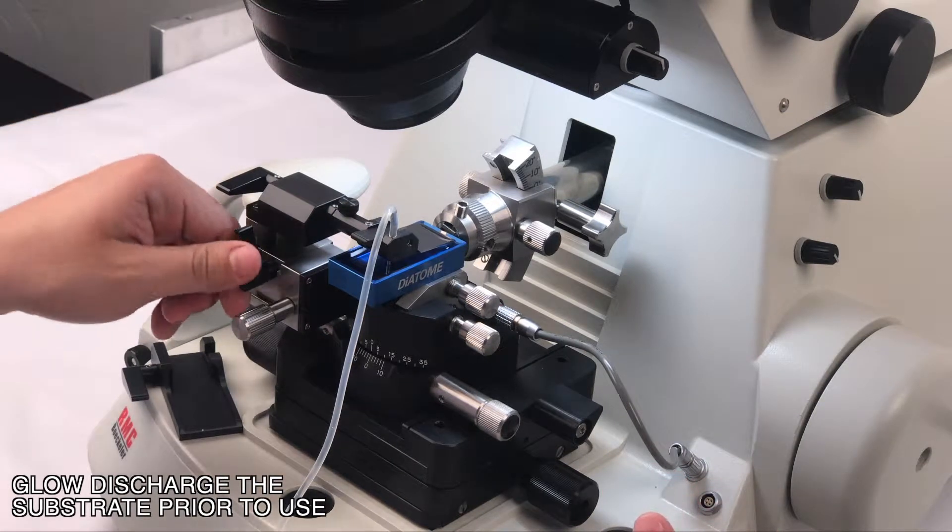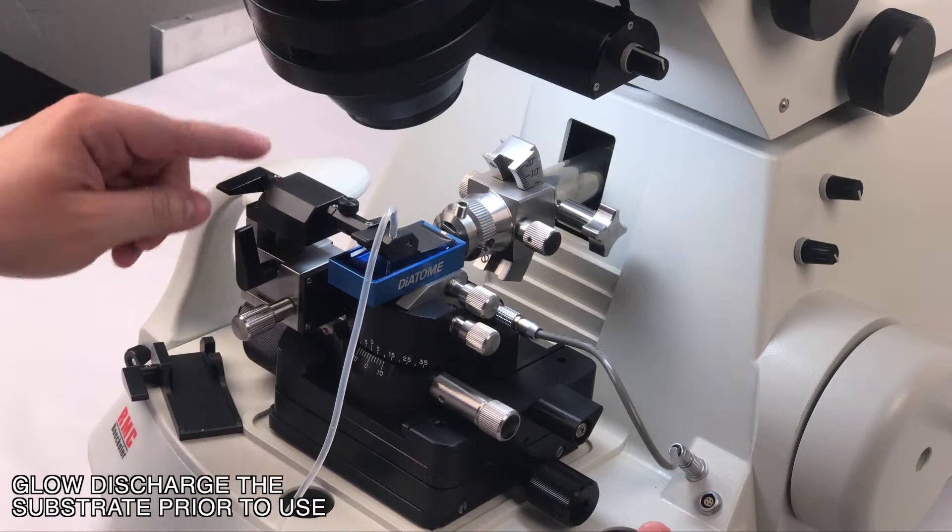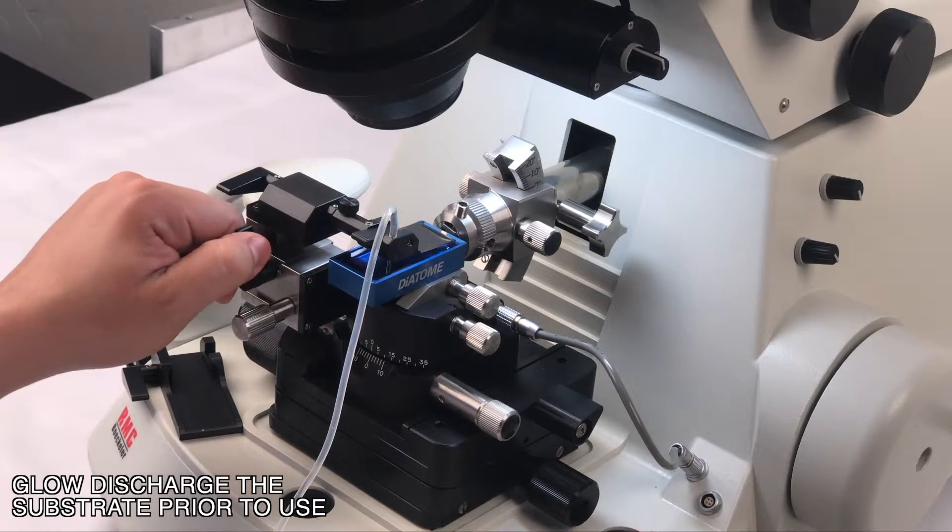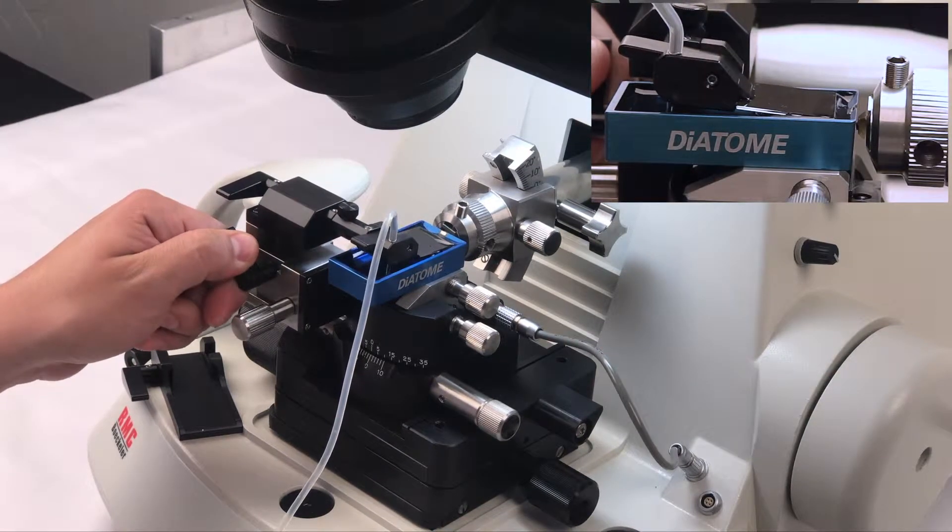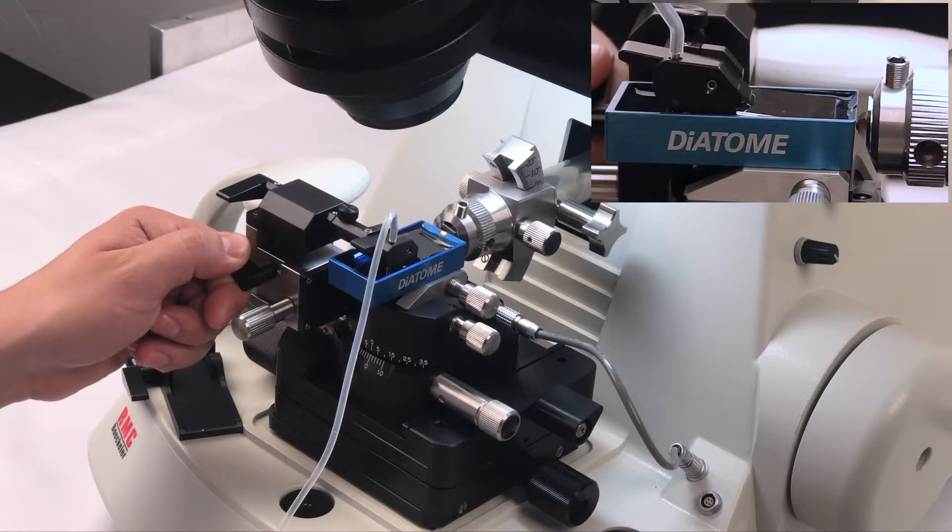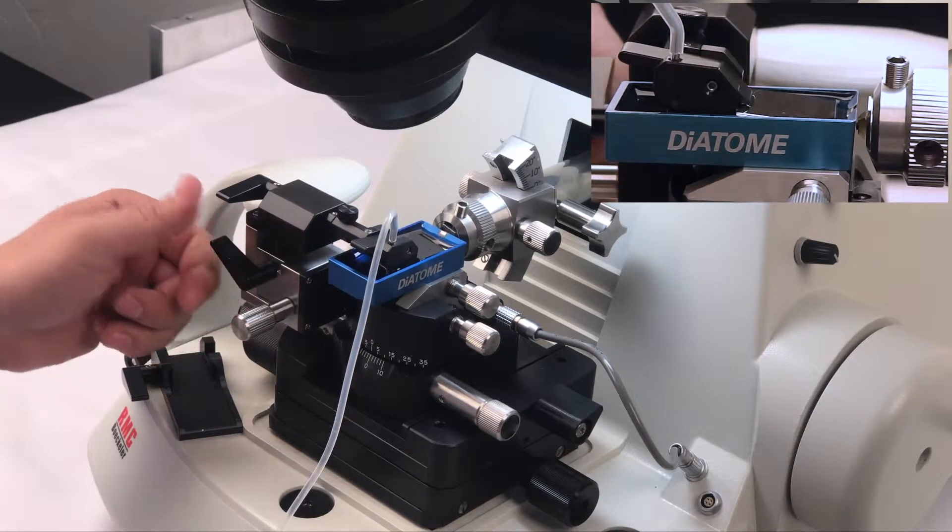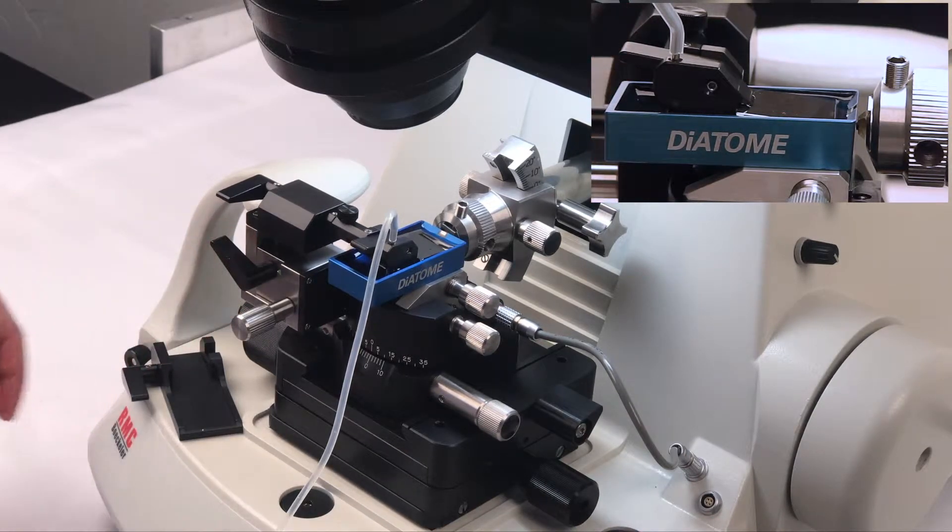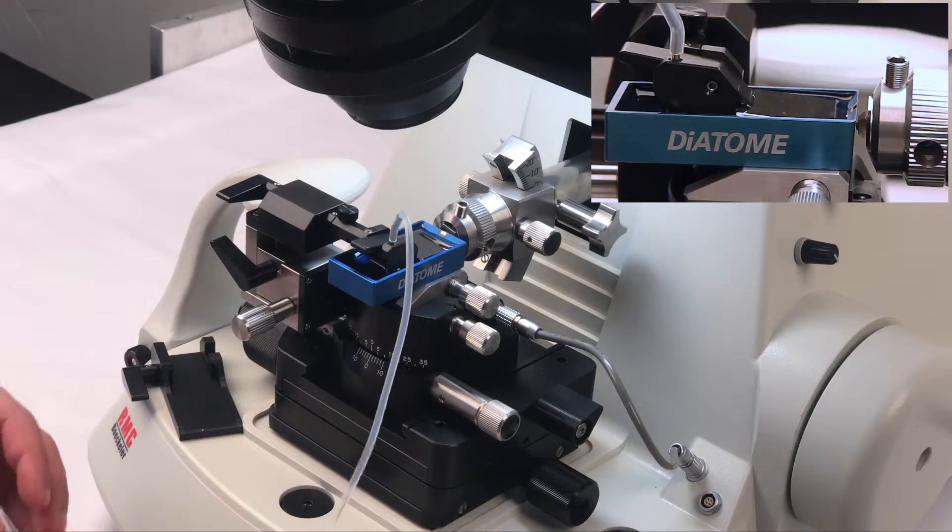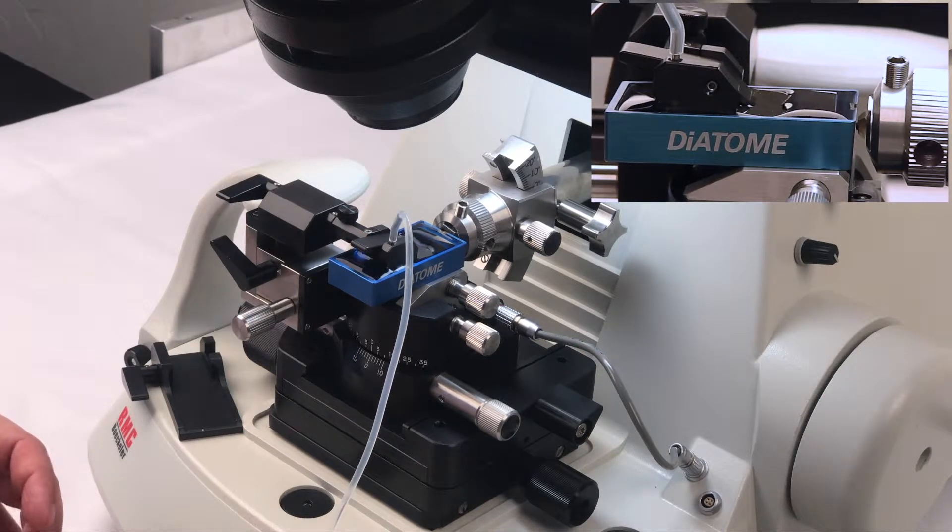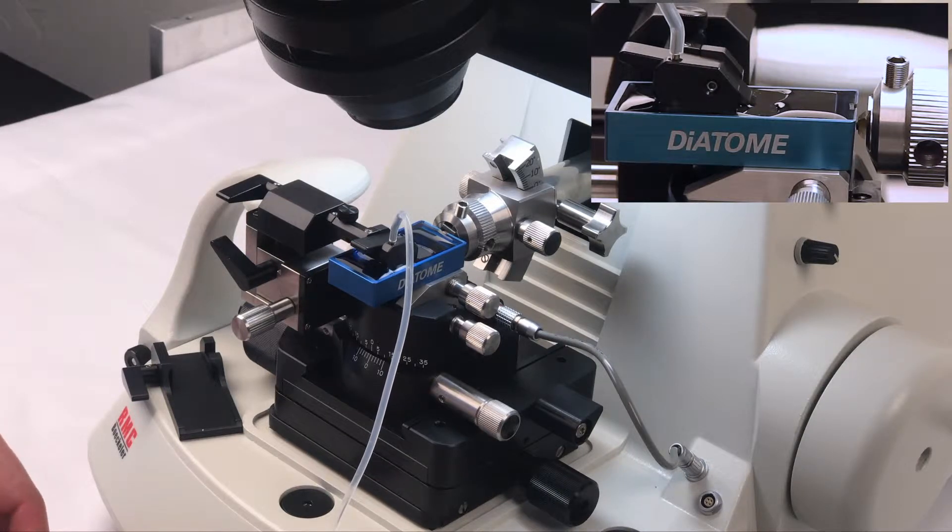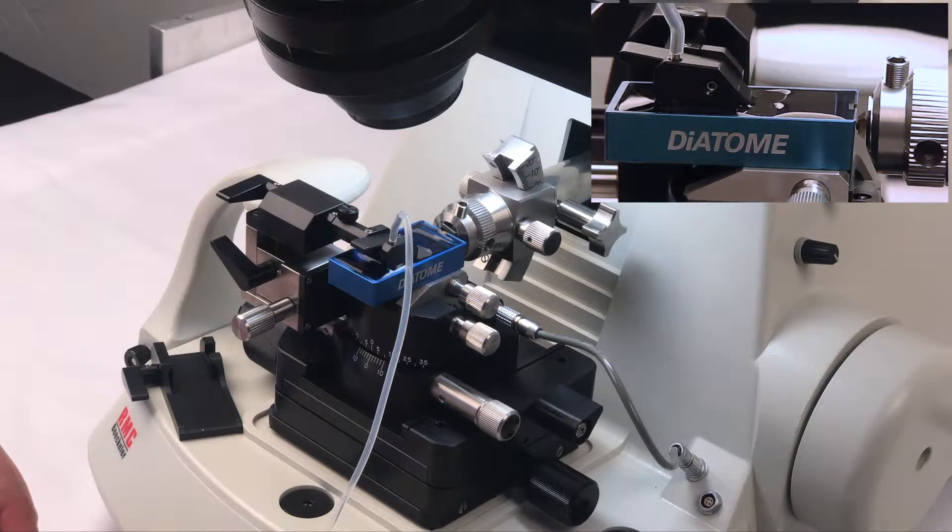The first thing we're going to want to do is lower the ash 2 with the vertical leverage until it sits underneath. At this point we can see that it needs more water, so using our syringe we will add water. Now that we can see the bubble, we can remove a little bit of water.